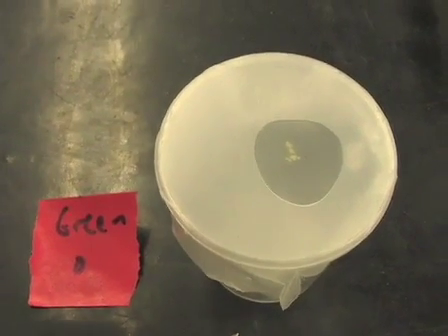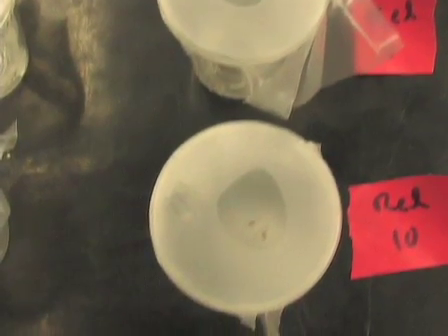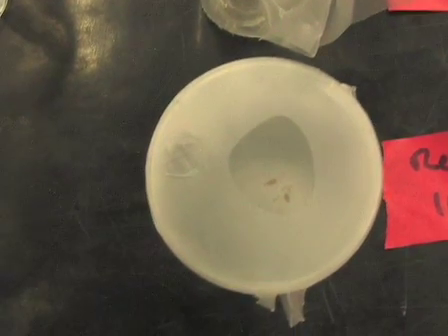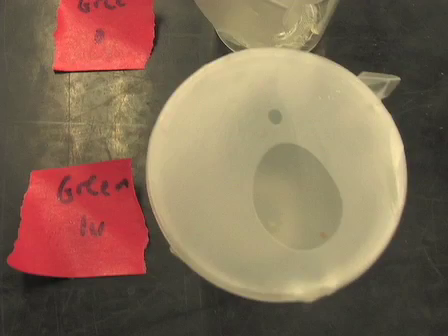And you can see, for the control diet, zero micromolar nicotine, both the red and the green aphids are surviving and reproducing. Likewise, on the ten micromolar diet, we have a large number of red aphid progeny. We still have green adults, but they don't have very many progeny. So they may be feeling the effects of nicotine even at as low a concentration as ten micromolar.